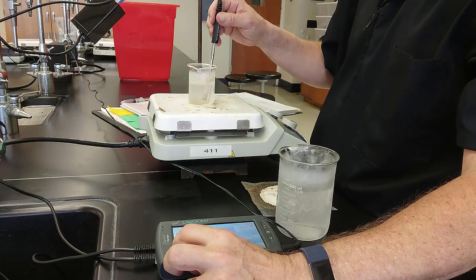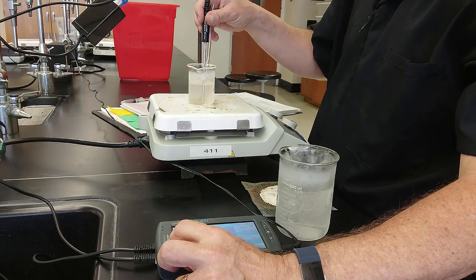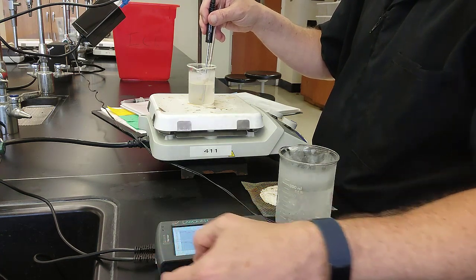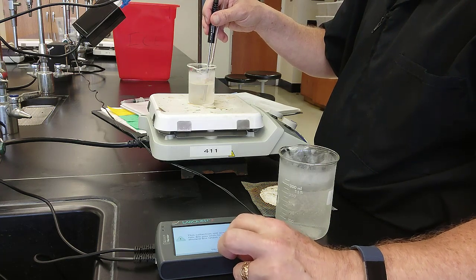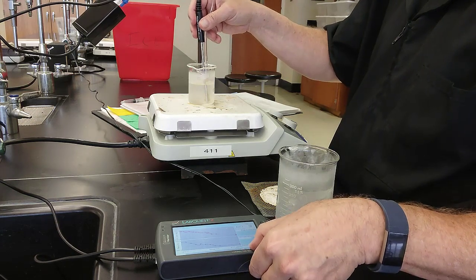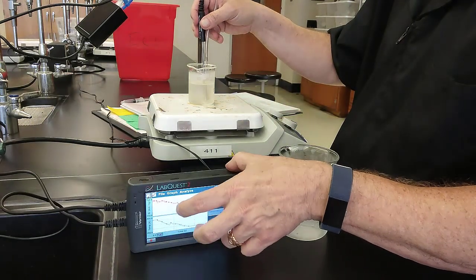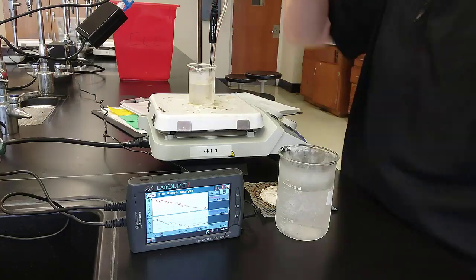If you've set your time properly, which I didn't, then your time will continue to run throughout the experiment. I'm just going to start again. I will just append my data this time. And we'll see what happens. I'll bring it a little closer.